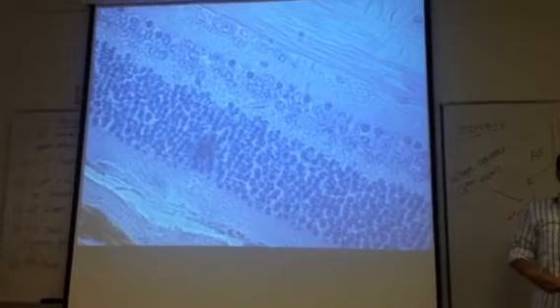Wouldn't that be the axons? This would be like the axons of the ganglion cells. So those are the axons of the ganglion cells. And they all go and they congregate where? They come together at the... Where do they go to? You gotta go somewhere. Optic disc? So they all come together at the optic disc and form the optic nerve.